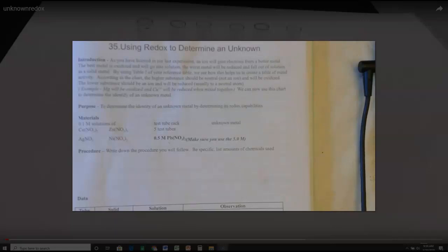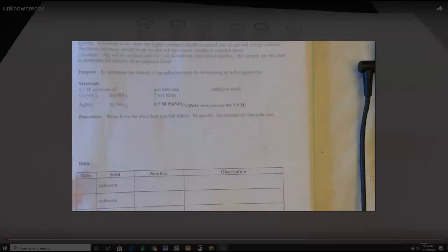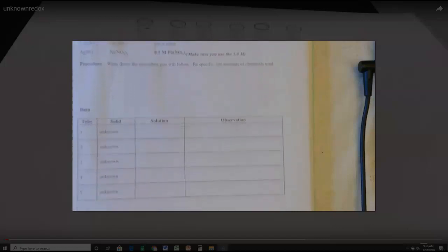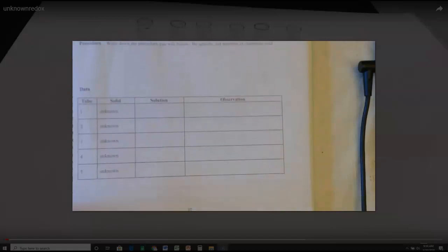Here's the fun part of this lab. Look at the procedure. Nothing's there. All you're going to do is write down what happens, write down the procedure. It's very simple. It's almost identical to the last lab. And what we're going to do is we're going to take a solid unknown, you know what this is, and we're going to put them in the different solutions.